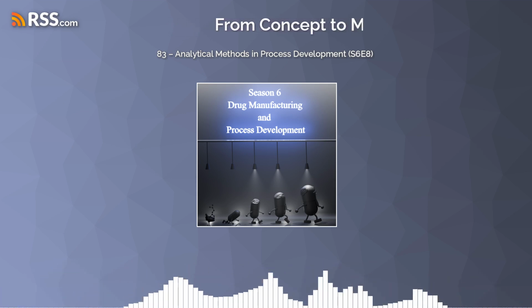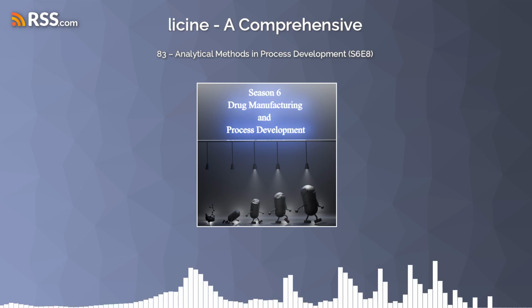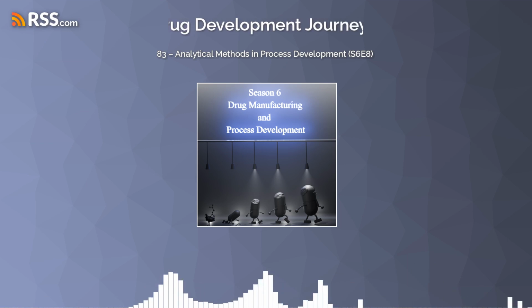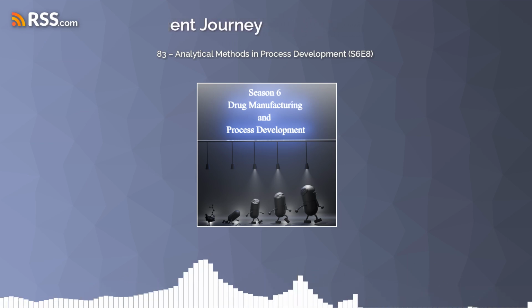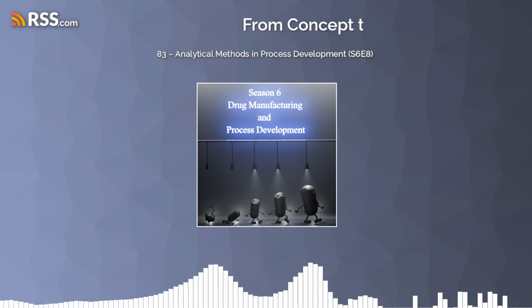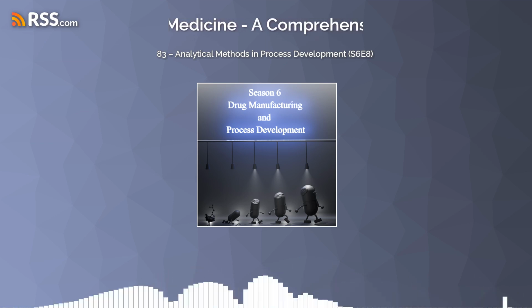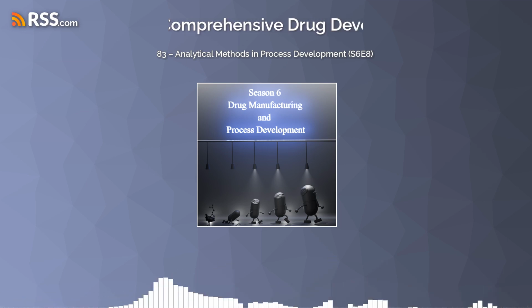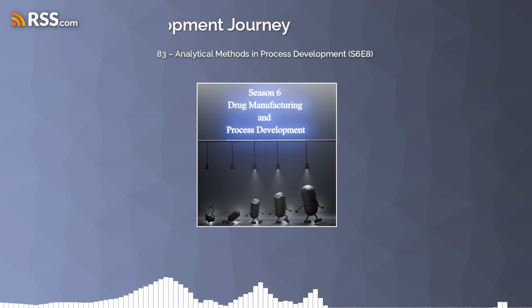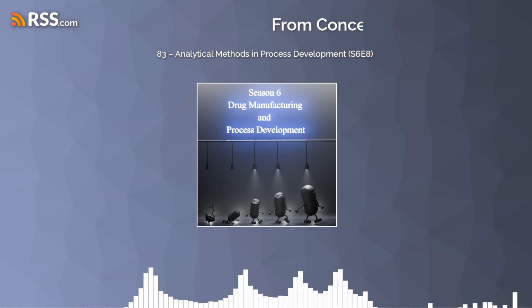Another great example is from OPR&D 2014a, which describes the isolation of an olefin compound. And while that paper focuses on solvent screening and crystallization for purification, you can be absolutely sure that analytical methods, most likely HPLC, played a really important role in determining the purity of that isolated olefin after each step. It seems like they're being used all along the way, not just at the end. Exactly. You need to know how well your purification is working. So you need that confirmation to know that you've separated what you want from everything else. Exactly.